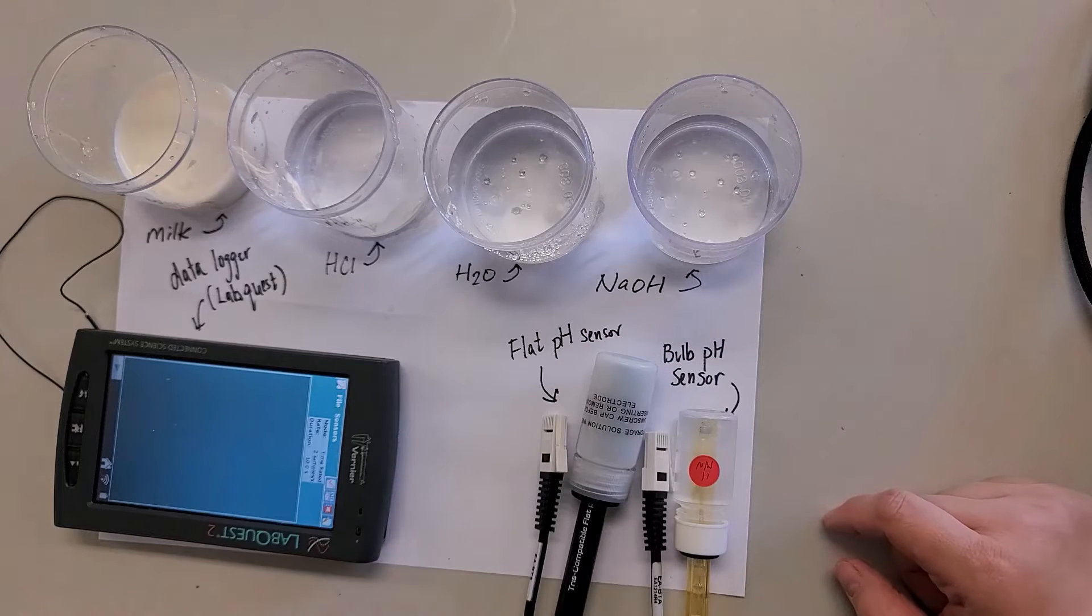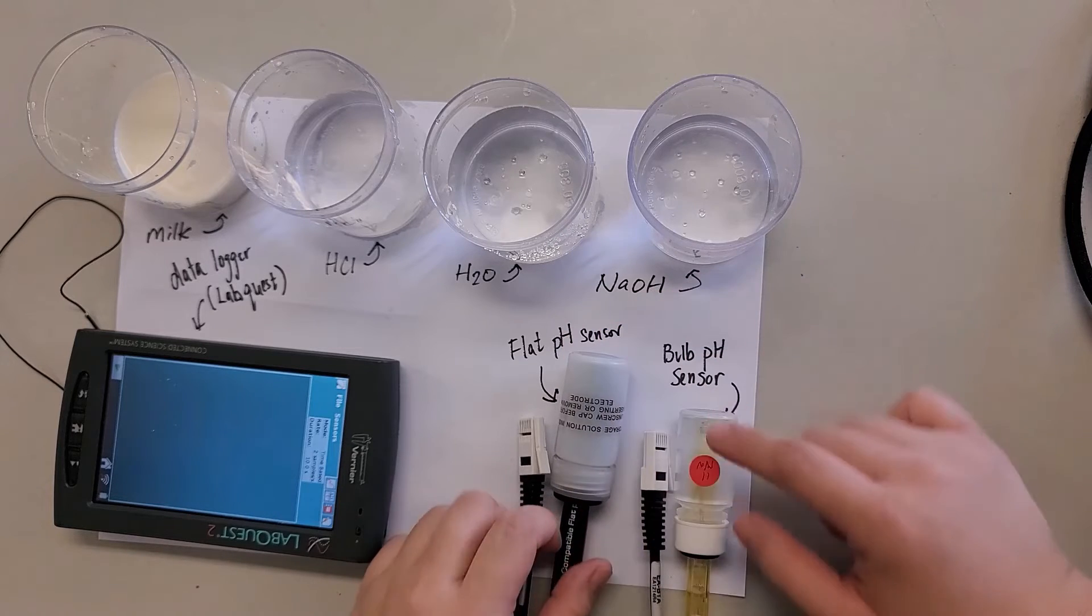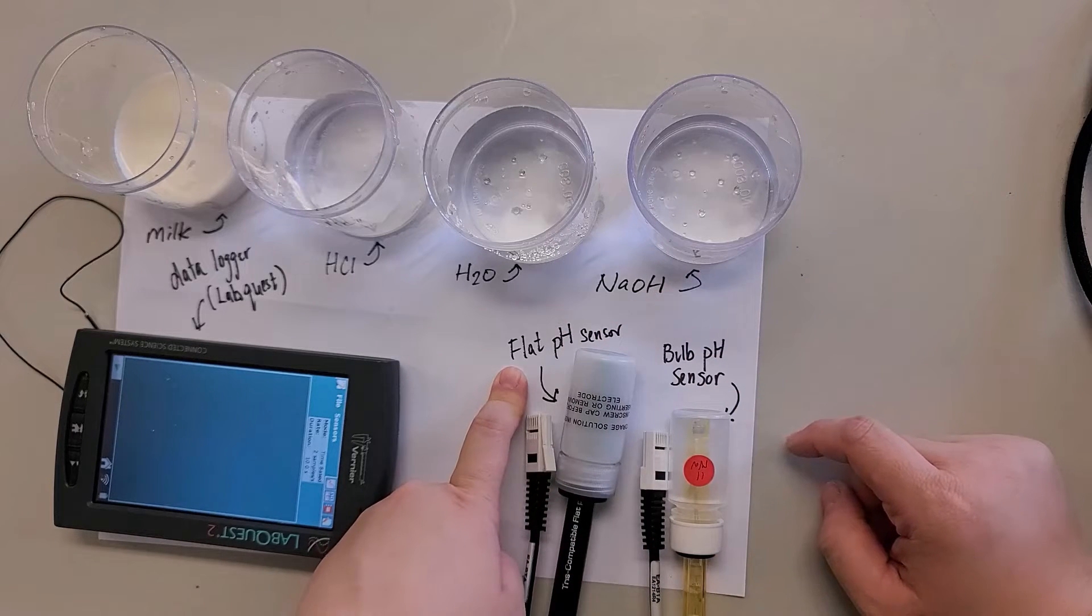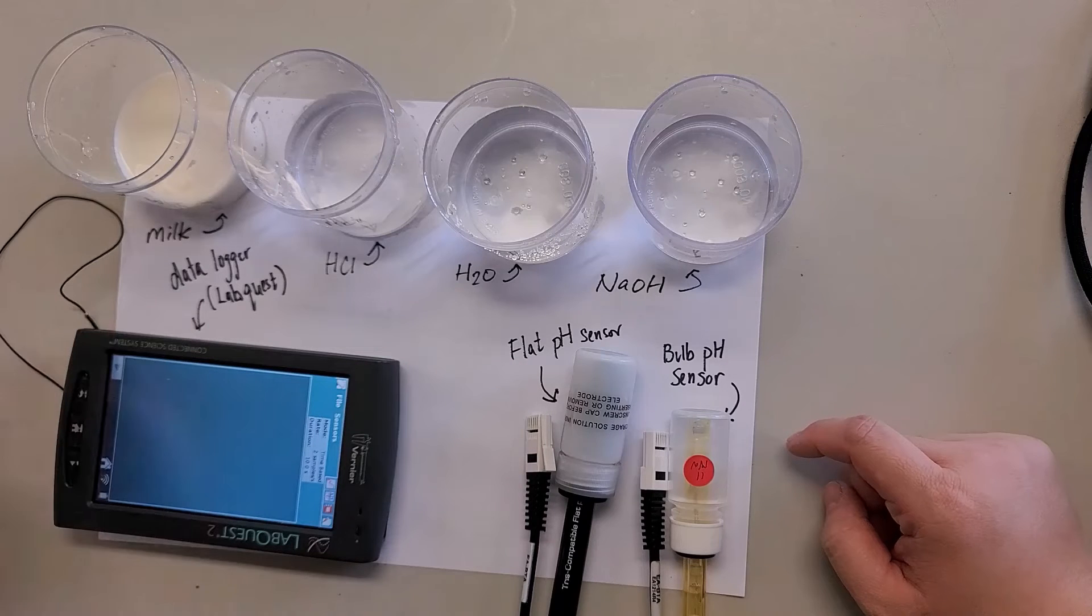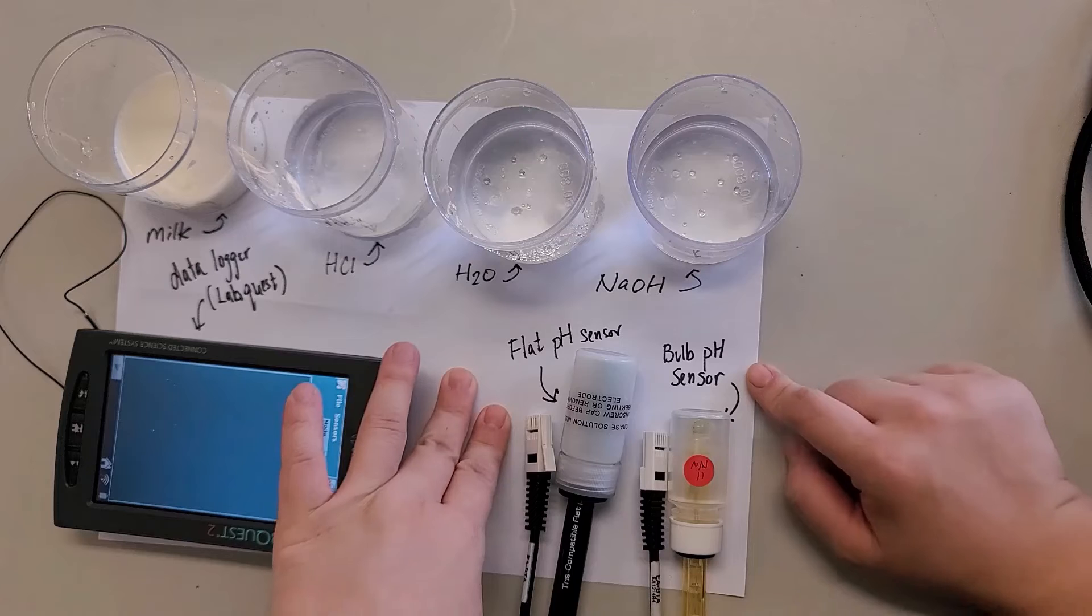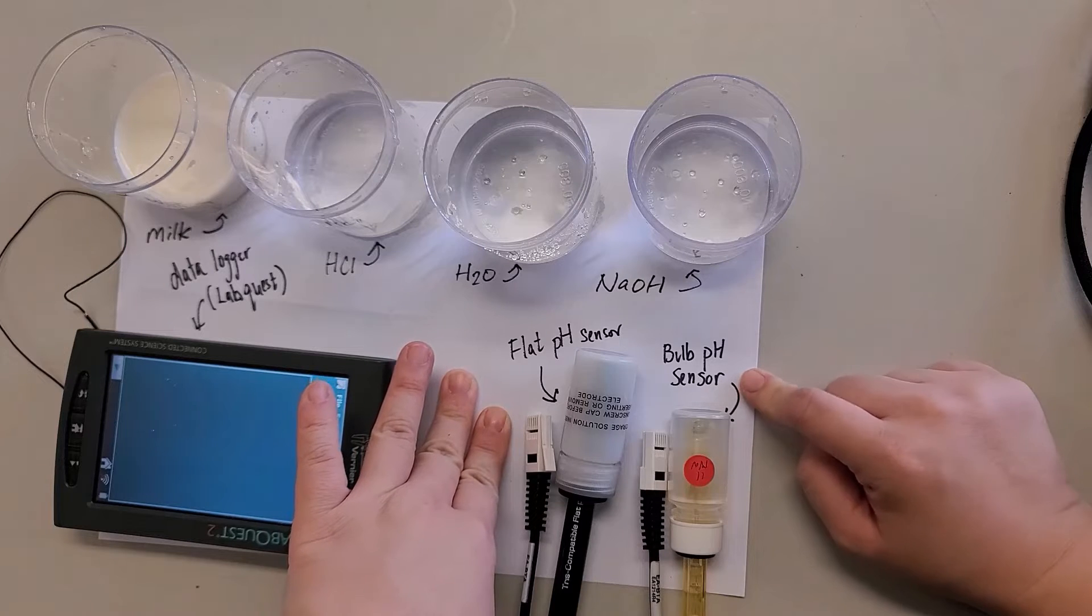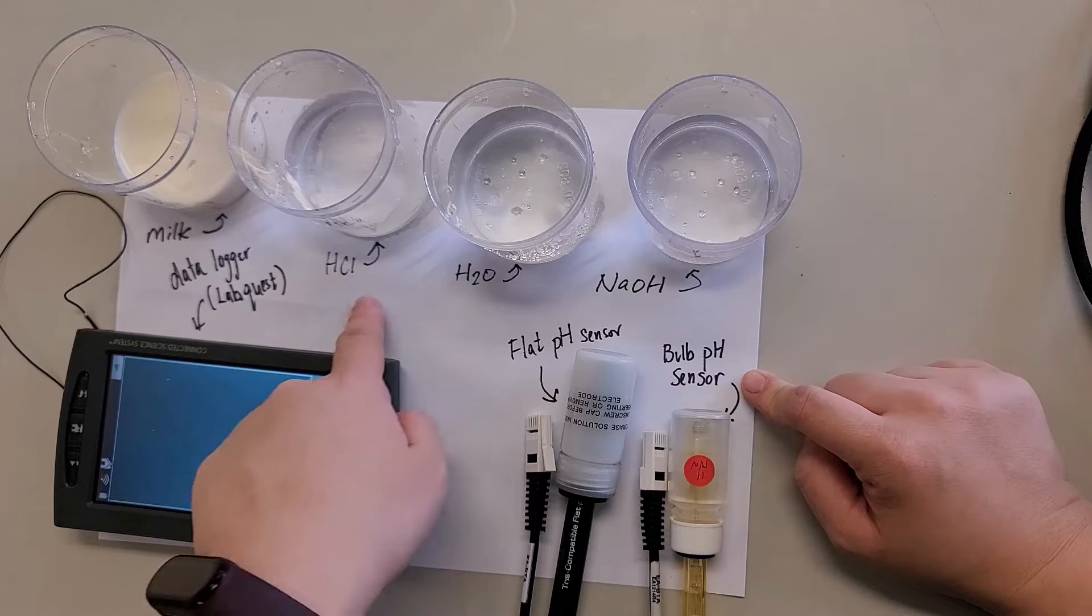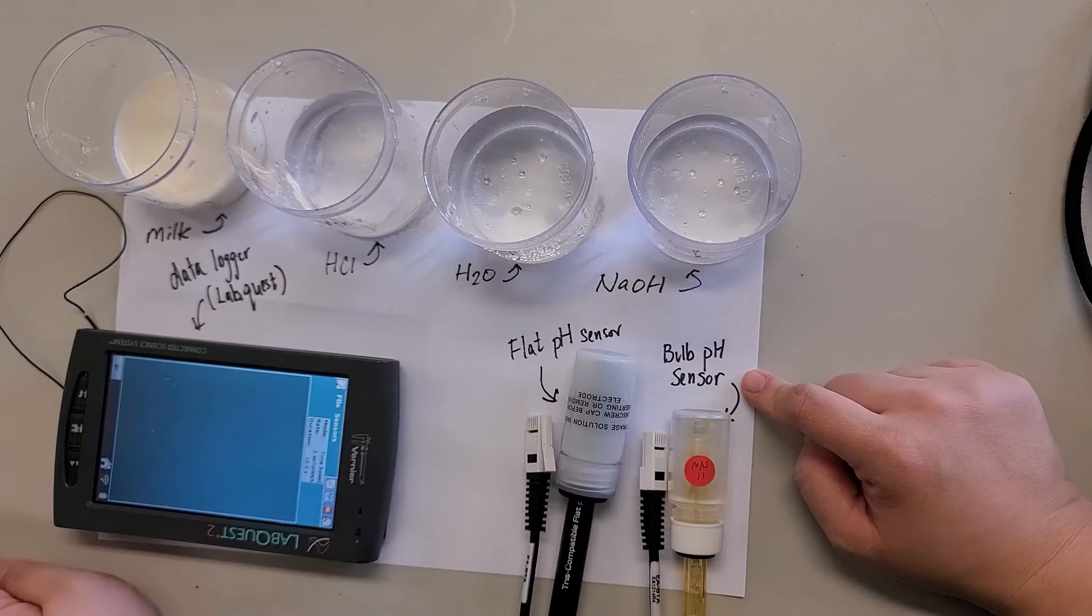Same thing is, there's two types of pH sensor. One is called the flat pH sensor. It's used to measure colloid solutions, such as milk. And another one is the bulb pH sensor. It's used to measure clear solutions like these.